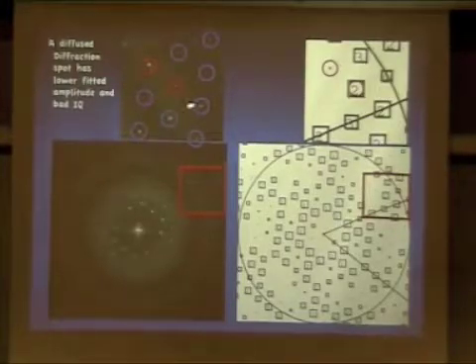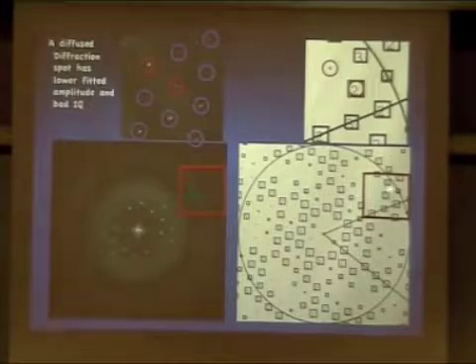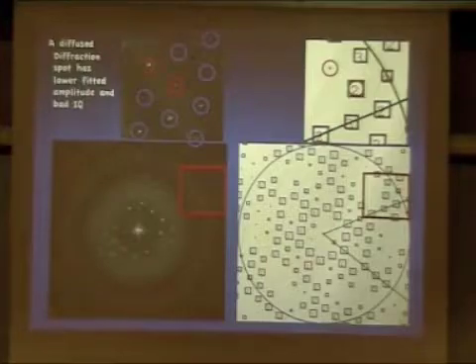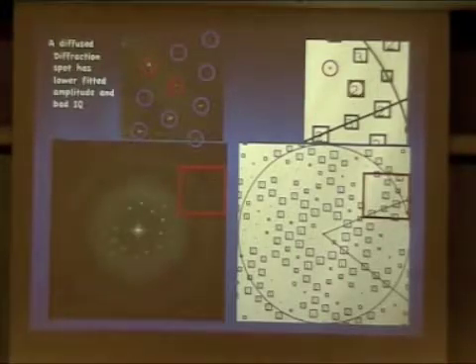For example, here we are looking at the region around those two. You may find that in your images there will be some strong but diffuse spots that will come out with very low IQ values. You look at the amplitude, it will turn out to be very low. This is because the fitting is only concentrated on those 2 by 2 pixel boxes.